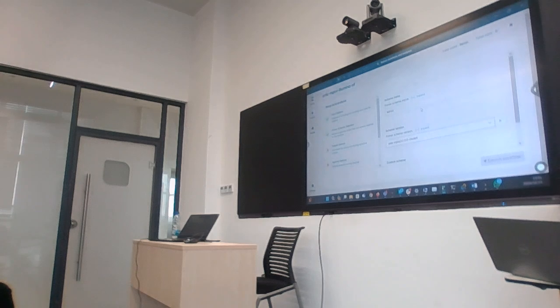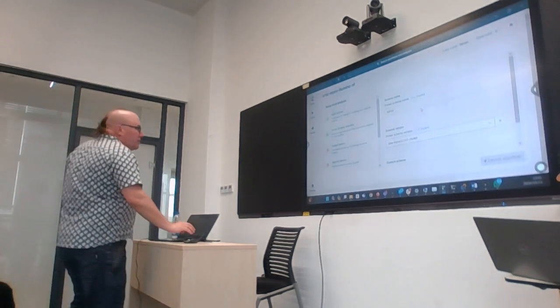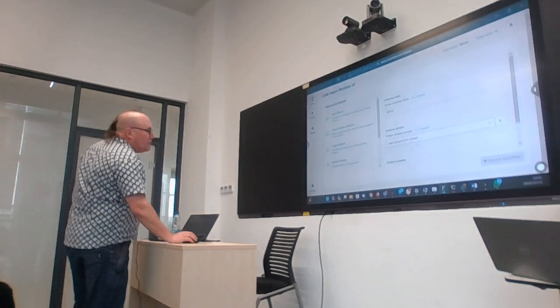Now, behind the scenes, what this is selecting is two files. Okay. The FASTA reference, the genome that we're going to compare against, and the bed file that describes the primers and the positions. If you remember yesterday, I talked about the bed file, which describes which reference and at which position the primers are found. Okay. So primer scheme selection must be clade 2.